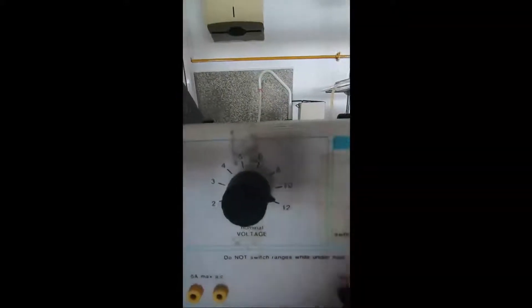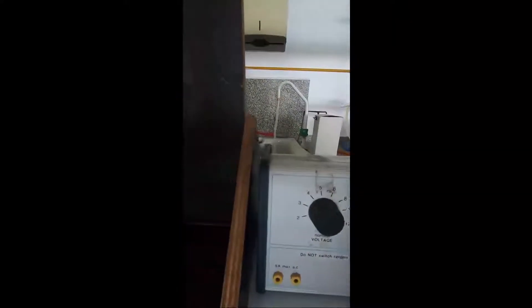We've already got it set to 12 volts, so if we flick the switch, let's have a look to see what happens. Straight away you might be able to see some bubbles of gas being produced at both of the electrodes. Both of them are producing gas.